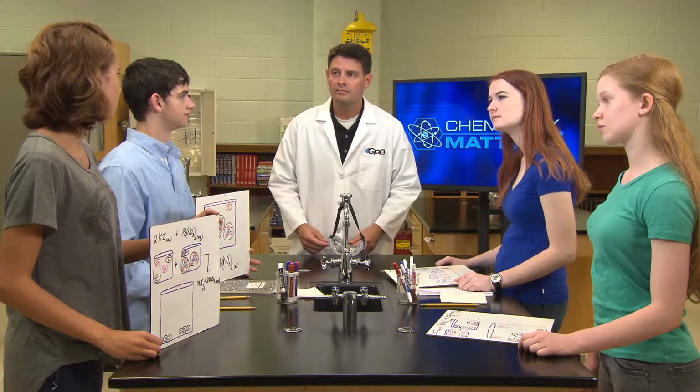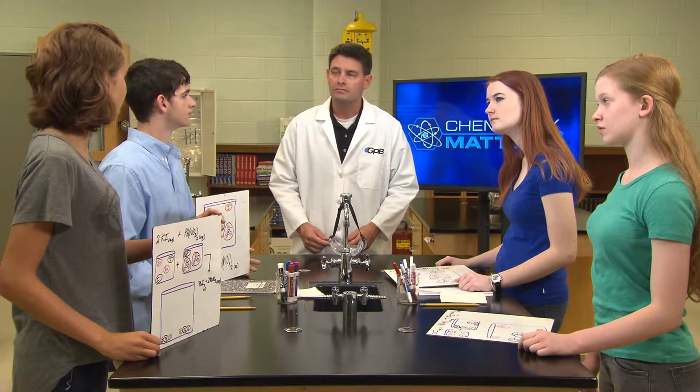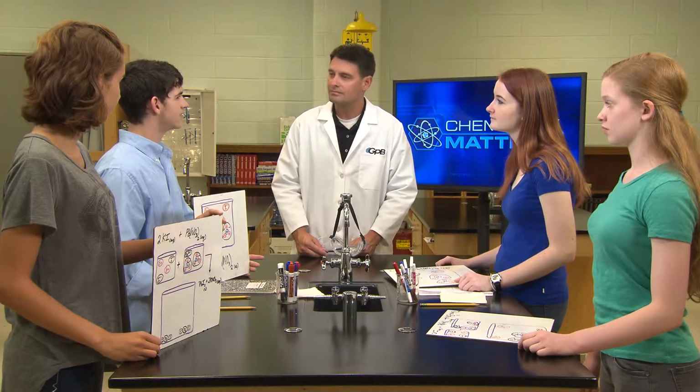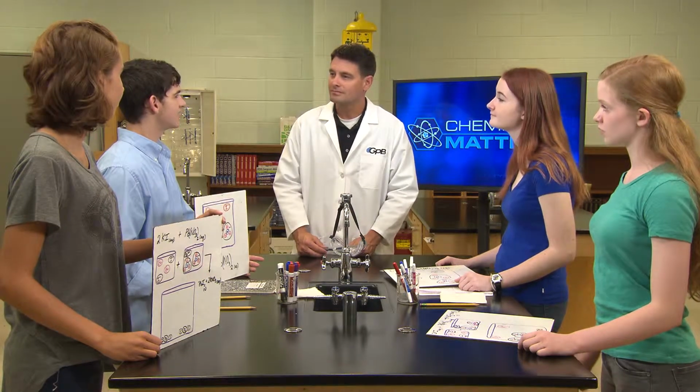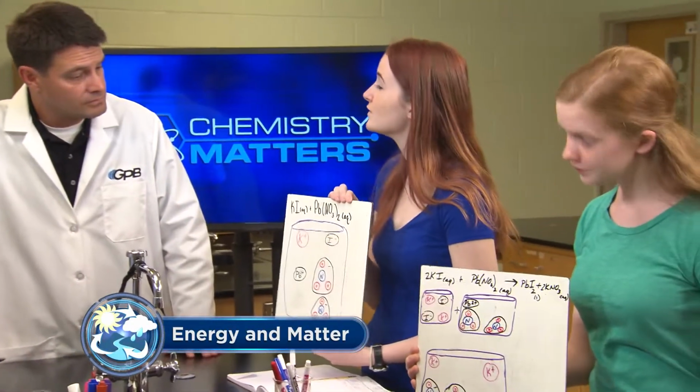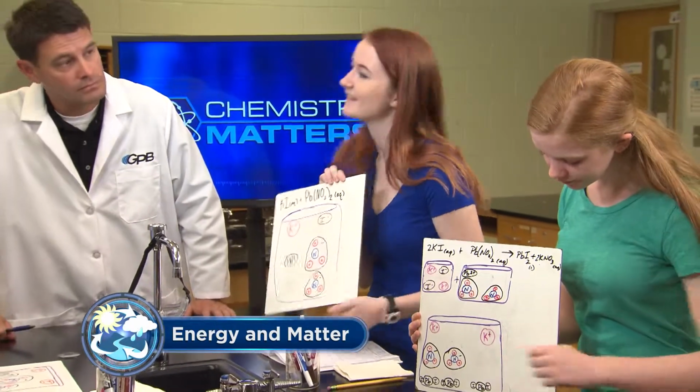I guess we know that they're still there because you have to start and end with the same amount of matter. Oh yeah, I think that's the law of conservation of matter, right? There's nowhere else they could have gone. You're right. How about you guys? Did you include the lead-2 iodide? Yes, after the reaction, we drew the lead-2 iodide all together on the bottom of the container.